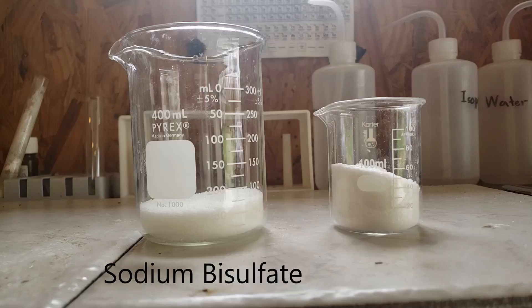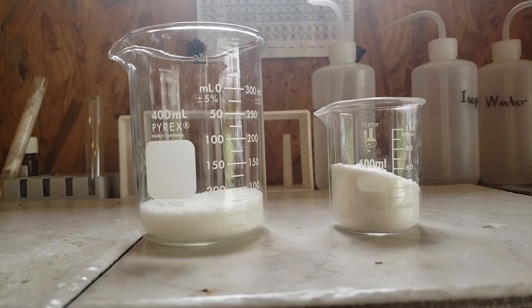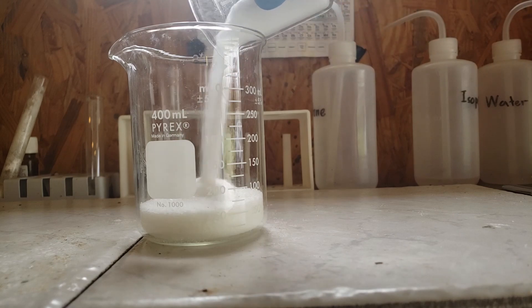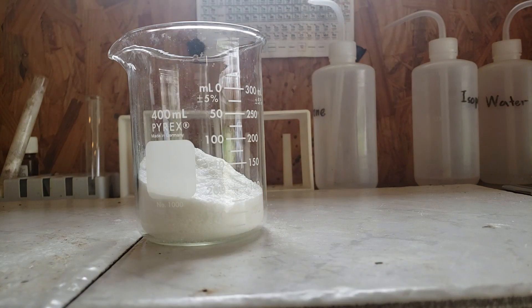First, I measured out about 100 grams of sodium bisulfate, which is an excess. I then measured out about 30 grams of anhydrous sodium acetate. I mixed these two together until I felt that the mixture was mixed enough.